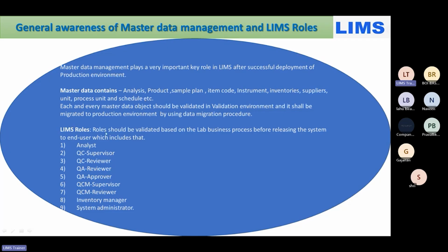Now the LIMS roles, the different roles of the working persons with the software: the analyst or end user, then the supervisor, reviewer 1, 2, approver, then the manager, lab reviewer, inventory manager, and system administrator. The system administrator handles all the login credentials. Any requirement related to the credentials will be handled by the administrator.